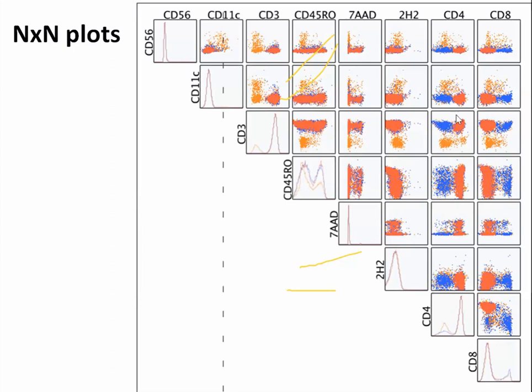So for all these, you need to manually adjust the compensation to correct it. Here, this one is poor, this is fine, this is poorly compensated, so you need to adjust it. You can find that spiking here; it's poorly compensated. So this is how you do post-acquisition compensation.